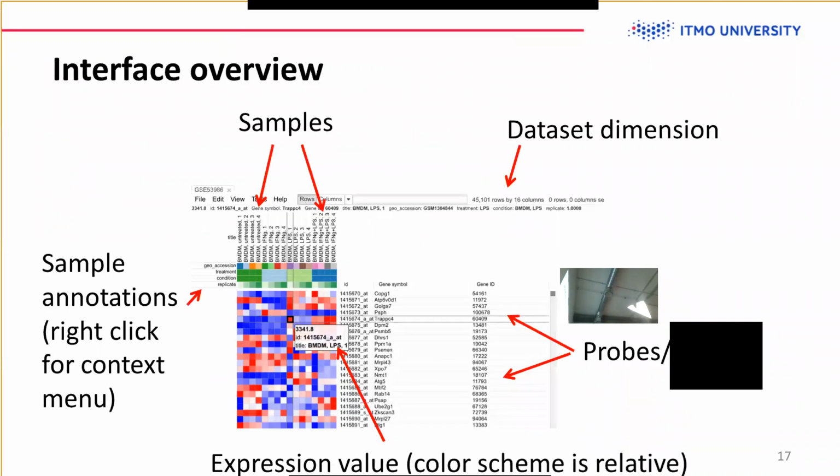Okay, so at this point, everyone opened the dataset, and it looks like this for you. Yes. If you do have any problems, for people on the Zoom, I don't see a chat, so if you have any problems or questions, please speak up.